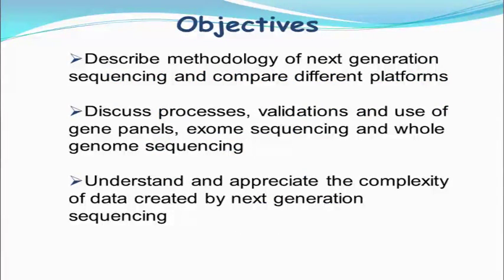Here are the objectives for today's presentation. I'm going to describe the methodology of next generation sequencing and compare different platforms, discussing the processes, validations, and use of gene panels and exome sequencing. I'm probably not going to touch on whole genome sequencing because it has not been used in clinical diagnostics yet. And then I will talk about understanding and appreciating the complexity of the data created by next generation sequencing.